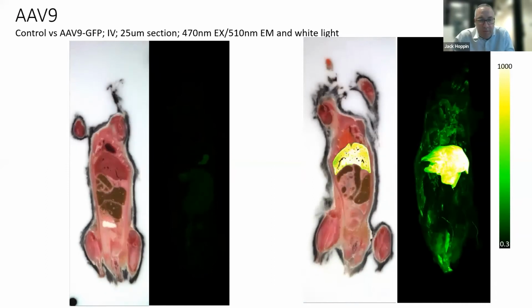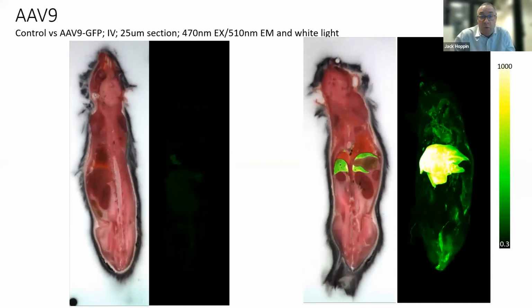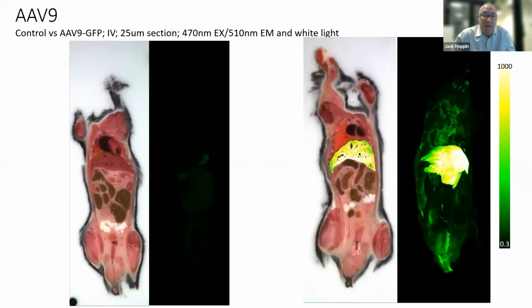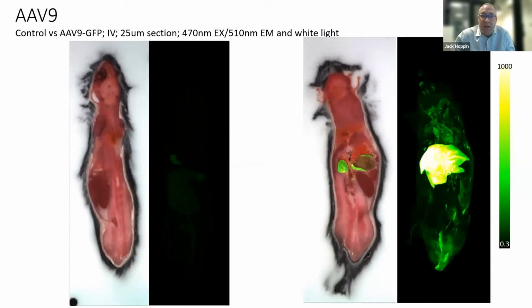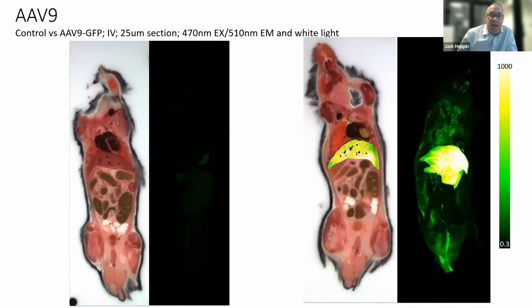There's porphyrins there. And on the right, I think it was 4 weeks later, I believe Hemi did this, and I saw his name on the call, so he can hold me to anything. But you're seeing where was the transduction? Where are we seeing now where was gene expression modified? And it's a striking image.